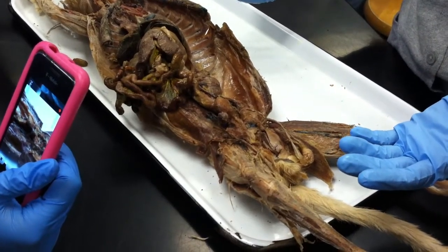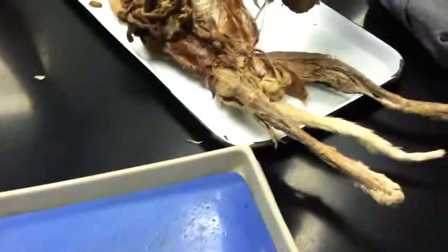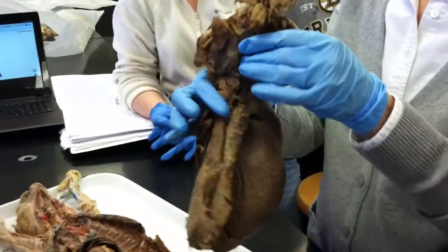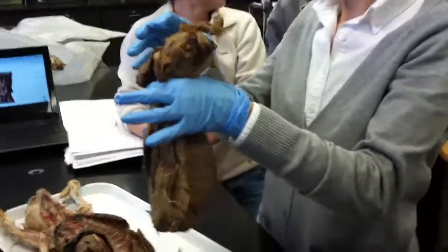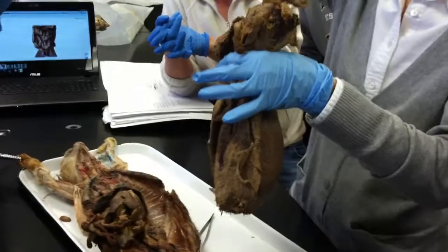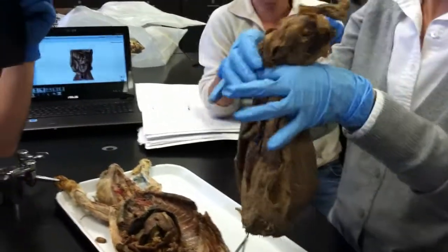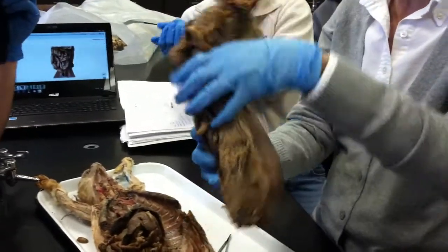Okay? If we look at our big boy testicle here, okay, this is our bull testicle. This up here is the spermatic cord and cremaster muscle. And you need a lot of muscle on this because this guy has to go up into the abdomen if it's cold. Shrinkage. Remember that episode? Okay, you need a lot of muscle to pull that sucker up. Okay, so it's cremaster muscle and spermatic cord in here.